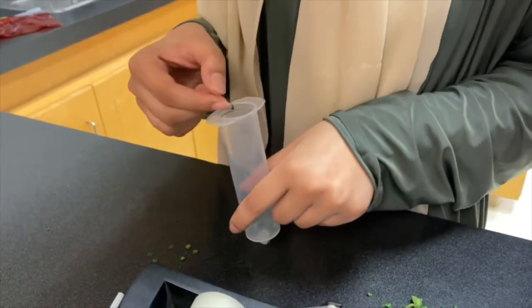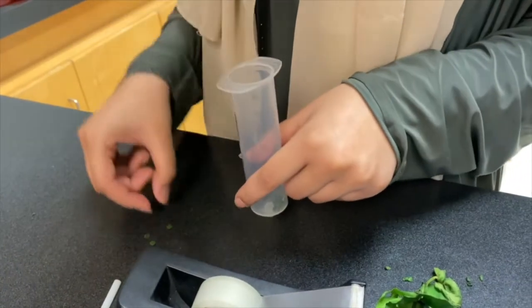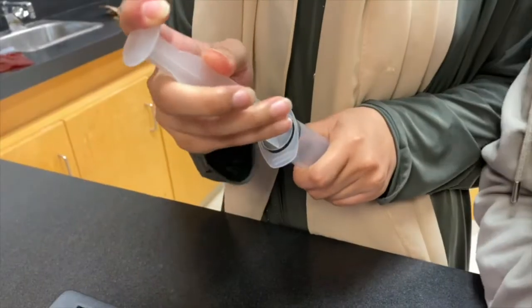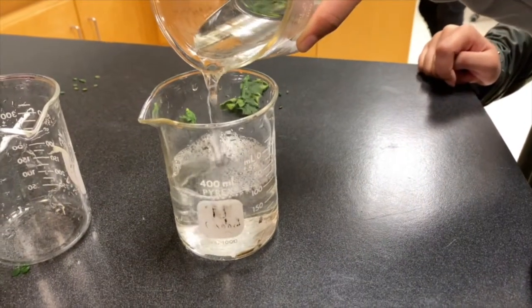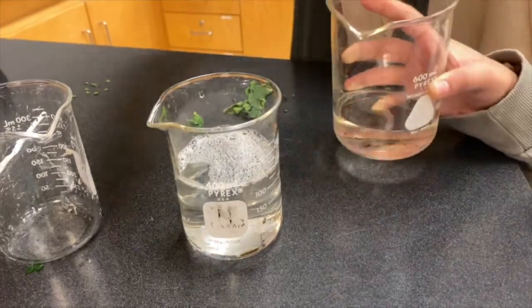Put the leaf discs into the barrel of the syringe and then tap them down to the tip of the syringe. You can do this by using a straw to gently blow the disc towards the tip. Put the plunger back into the syringe, being careful to not touch or damage the leaves. Pour 150 milliliters of the bicarbonate solution into each beaker. Try to avoid making suds.